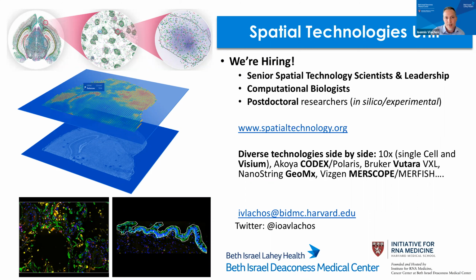Some assays are easy for pilot data. Other assays, if you have to design a new probe set from scratch, or you have to design a new antibody panel from scratch, might be a bigger time investment for a pilot. But we have pre-made versions, and if they're compatible, that's also an easy way to start.